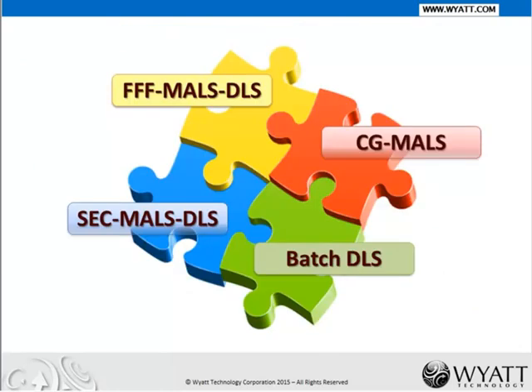Now, both MALS and DLS can be used on their own or in combination with SEC and FFF. When those orthogonal approaches are used together, they can give comprehensive and complementary information. Together with other techniques, we can put the pieces together and solve a big puzzle of either a protein solution or particle suspension. I will start with CG-MALS, then go counterclockwise to discuss each of those four different light scattering related tools and their application examples.